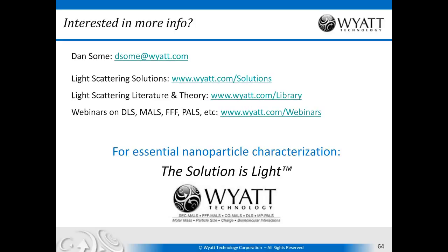What is the limitation in size measurement of your DLS equipment? So we typically state the sizes in terms of radius, and it also depends on the particular instrument. The plate reader goes from about half a nanometer up to 1 micron. The cuvette-based instrument, the Nanostar, goes from 0.2 nanometers up to 2,500 nanometers, or 2.5 microns.